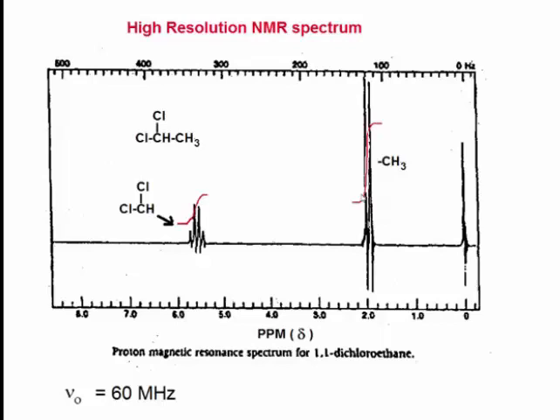What we're seeing here is a general phenomenon called spin-spin splitting or spin-spin coupling. In a nutshell, each set of signal protons is split into a multiplet of peaks. And this splitting is caused by the magnetic influence of the protons that are neighbors to the signal protons in the molecule. Let me explain.